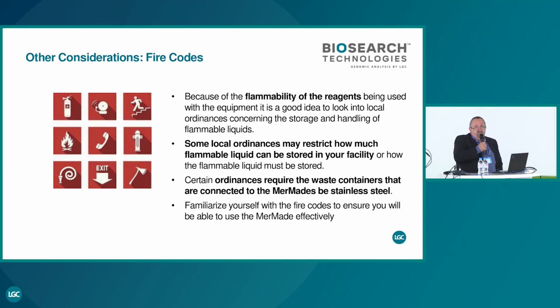Also, another thing, you have to think about the fire code. You remember I spoke about the ancillary reagents. These ones are very flammable. So according to your country, you have to check how you have to keep them, where you have to keep them, and what is the maximum quantity of reagent you can keep. This is linked to your country, maybe your state, your city. That's something you have to check by yourself when you build a new lab.